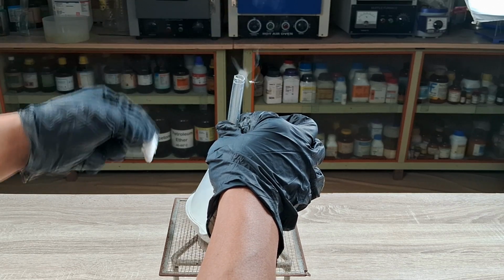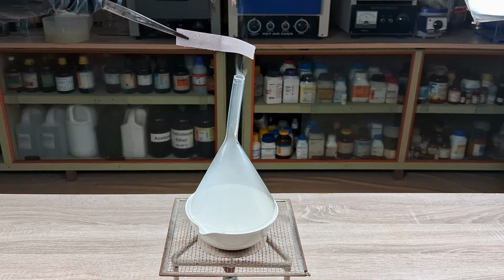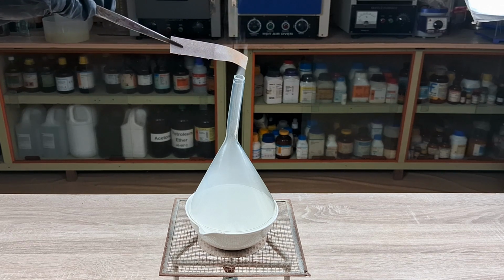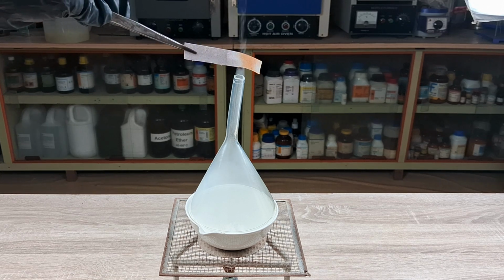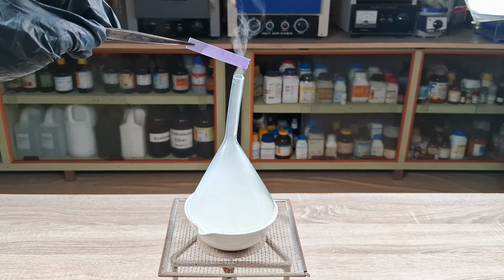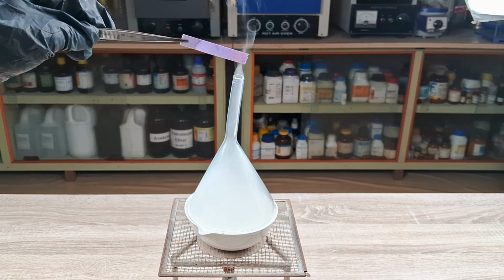At this point, if you remove the cotton plug from the funnel stem and bring a strip of filter paper moistened with Nessler's reagent, you will observe that the filter paper strip turns yellowish-brown as it comes in contact with the white fumes released from the funnel stem. Also, if you bring a strip of moistened blue litmus paper, the litmus paper gradually turns red.